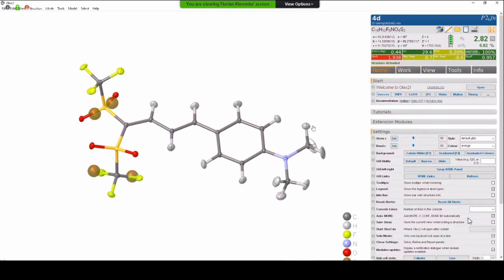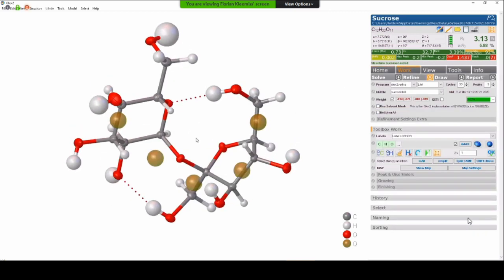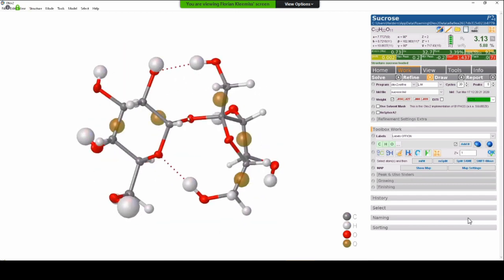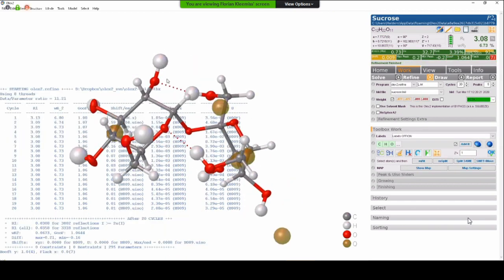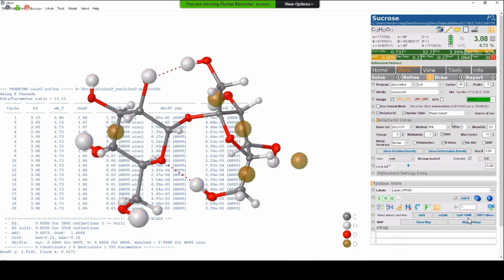And let's maybe put this to a test. So sucrose, if you have any experience with wave function calculations, you might say that sucrose is already quite a big thing to actually run the calculation on. And if we do the IAM, just to have the final IAM model, we see, okay, this is how we expect it to look. Actually, in this case, I have no restraints, I have no riding model. This is already refining hydrogen atoms freely, but I can now enable NoSpherA2.